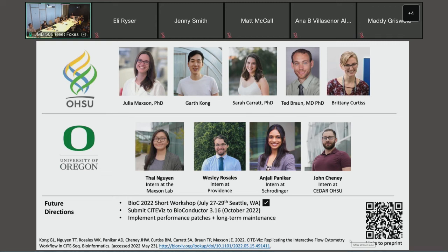Right. So in this example, we selected rather easier cells, that are fully differentiated, to test. Another way is to take one of those bone marrow CITE-Seq datasets and really try to start gating on those as well. We just didn't have the time to dive deeper into those bone marrow CITE-Seq datasets and try to reproduce other people's results. But with PBMCs, it's the easier, level one.